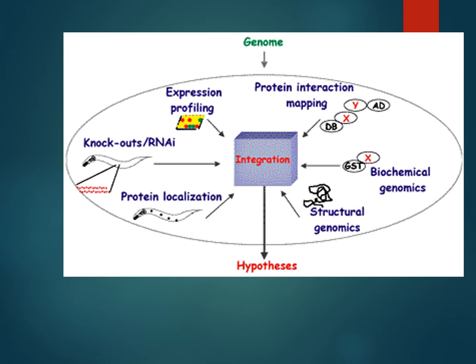And we're going to hit then protein interaction to understand protein X and Y come together. What do they do? Where are they doing it? Who are they interacting with? You know, what's the order of interaction? Do they show up in a disease or not? These are some questions. So there's kind of a grand hypothesis, but each technique does have questions as well, and those should be pursued.